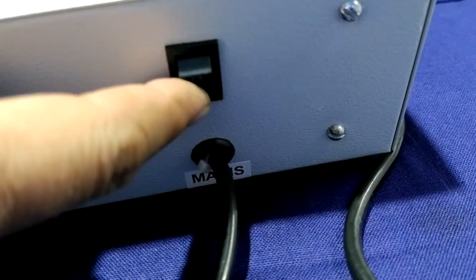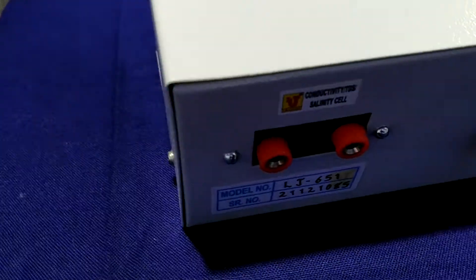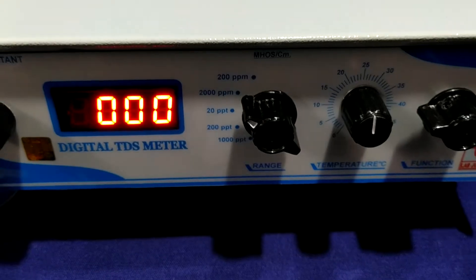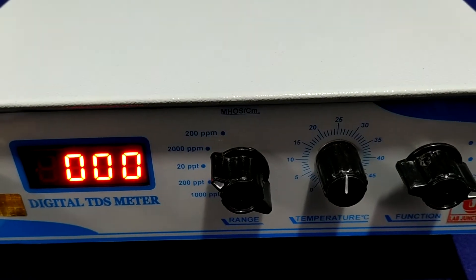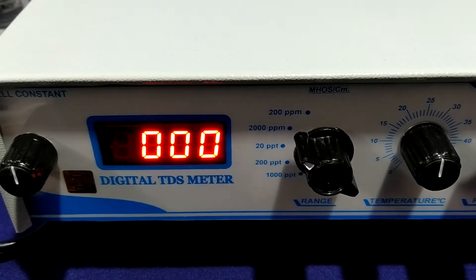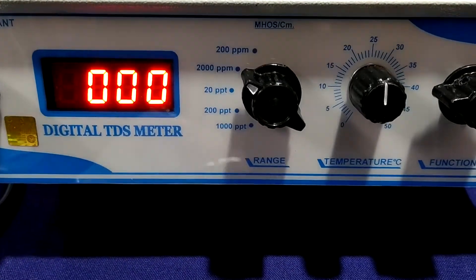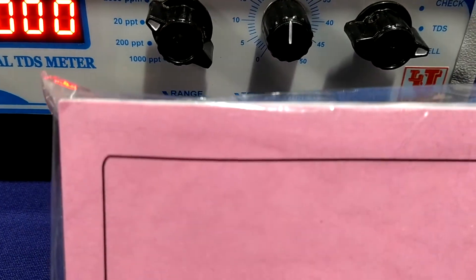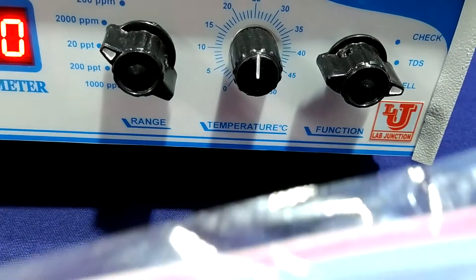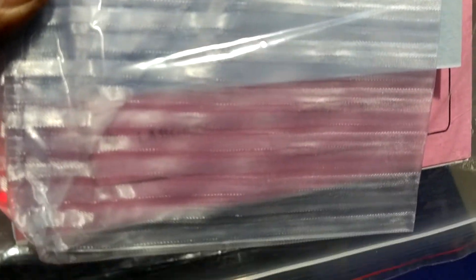This is the on-off switch and this is the main chord. I am now switching on the instrument. The supplied accessories include an instruction manual with a one-year warranty card.